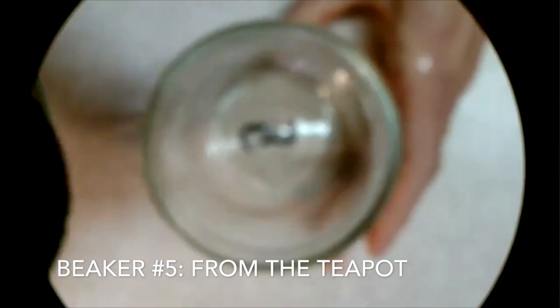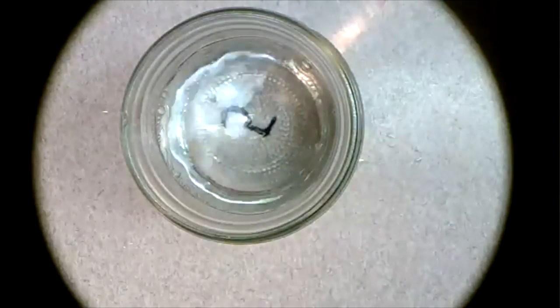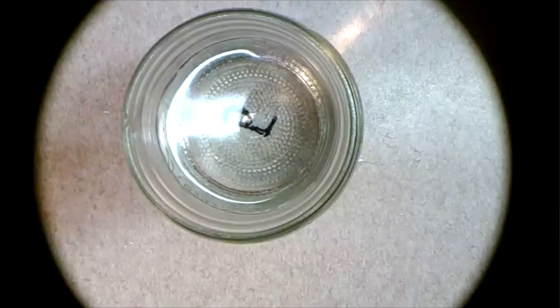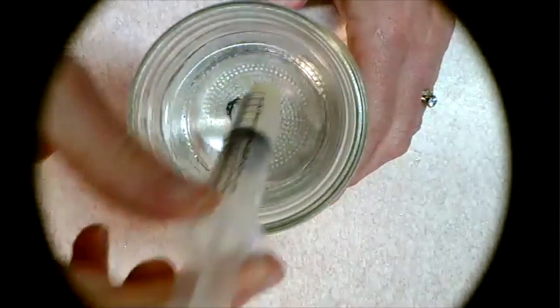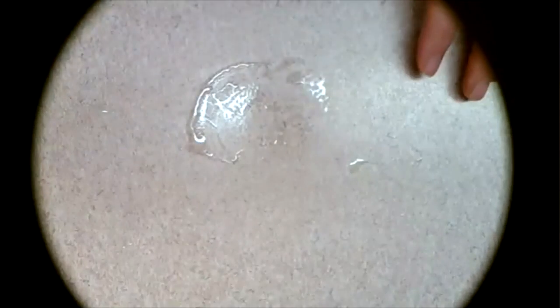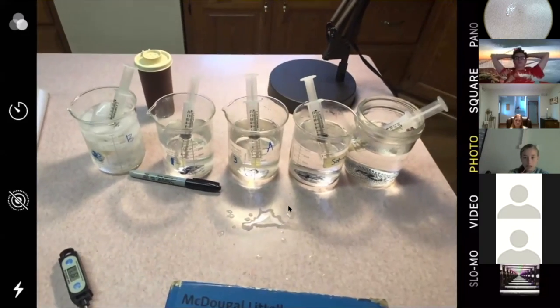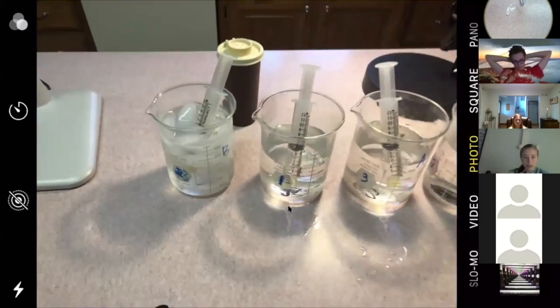This one is 5, and I'm using my tea kettle to put what was once boiling water in it. And again, a 5 milliliter syringe of air, and I'll stick it in there to come to equilibrium. So there it is. We have all 5 beakers with syringes in them.